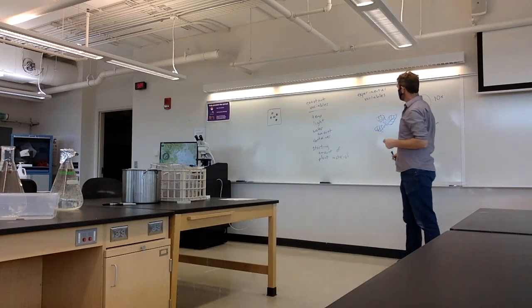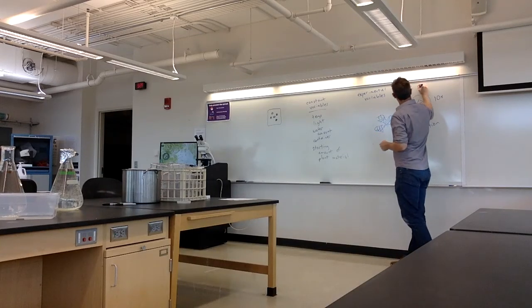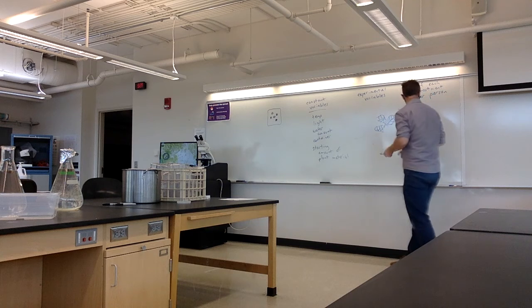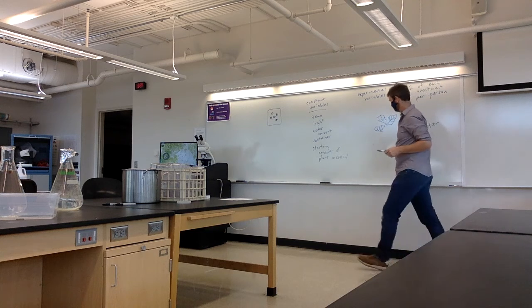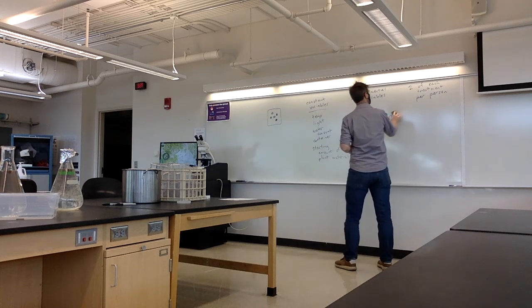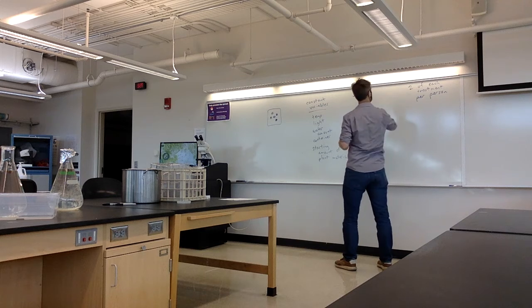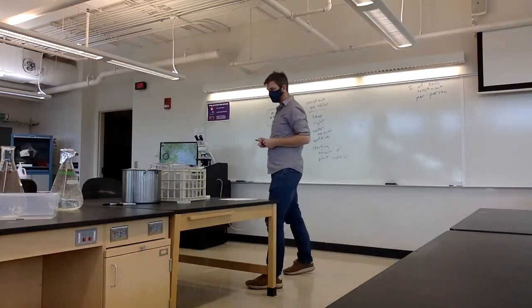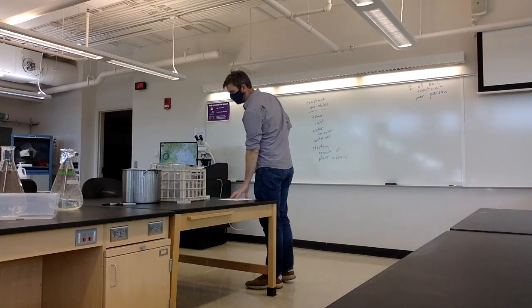What if we did 2 of each treatment? So if we do that, we got 4 in the room, 3 come to the next section, so we'll have about 15 replicates for each treatment. That's not too shabby.